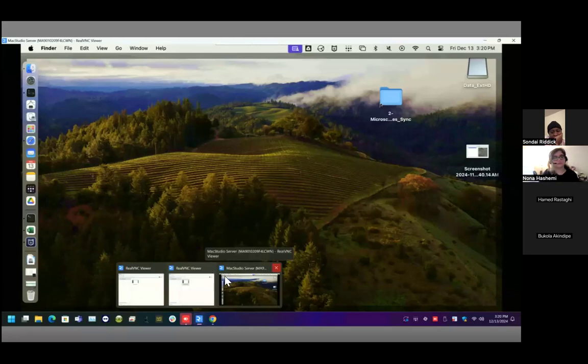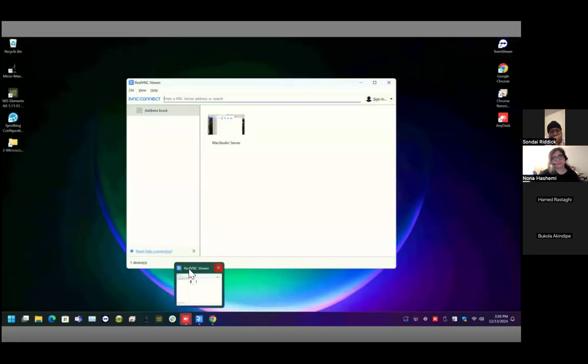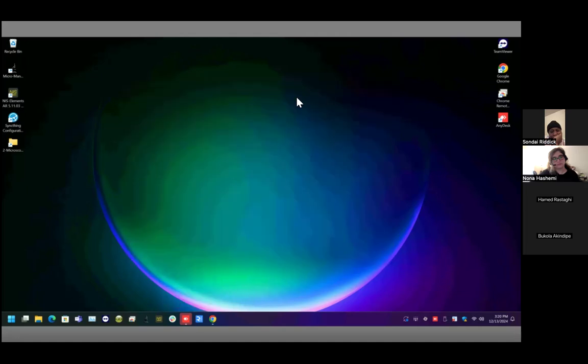All right. So right now, I am remotely connected to the microscope computer in the lab. You can also do this, but Enrique and I are still trying to find a way to connect this via Tailscale. But currently, I am using AnyDesk, right?